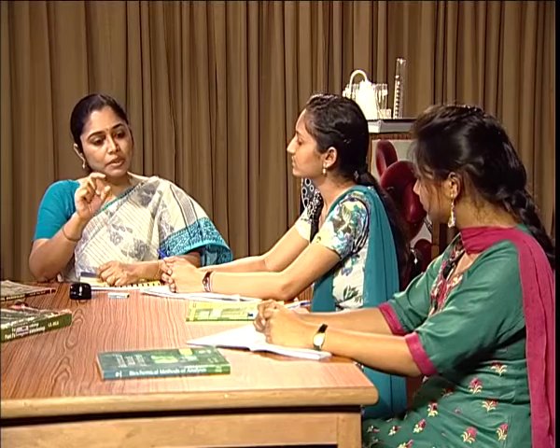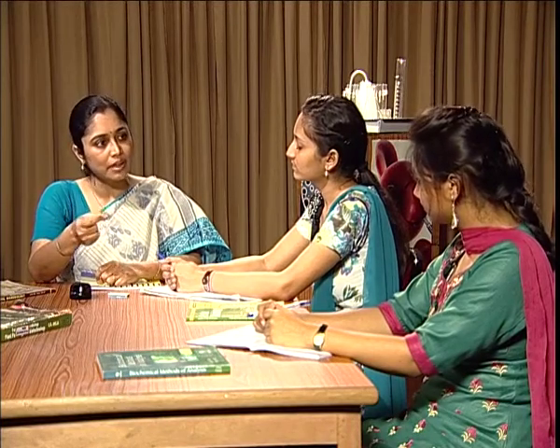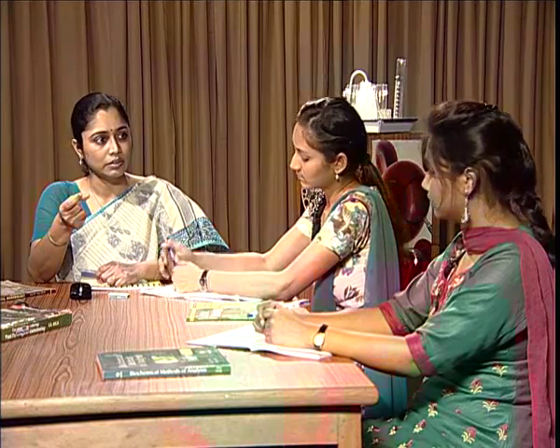Ma'am, what is chromogenic substrate? Chromogenic substrate is a molecule which changes its color after oxidation, so that we can very easily see the change in color.